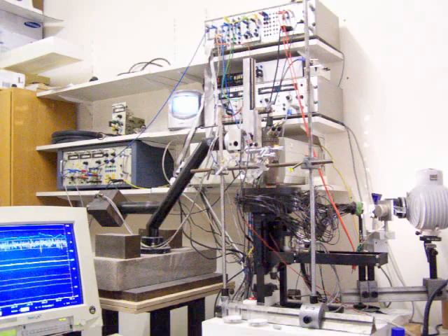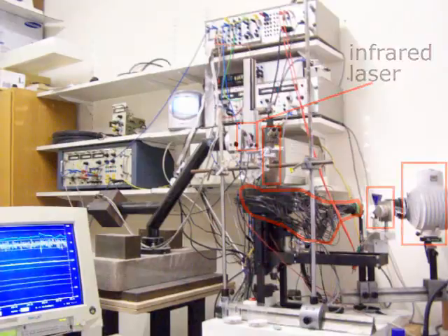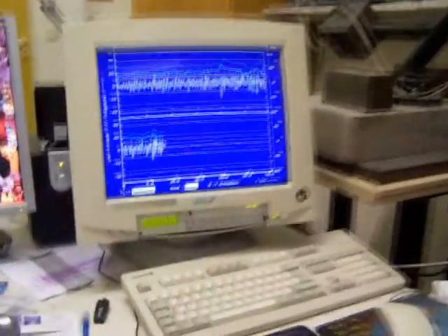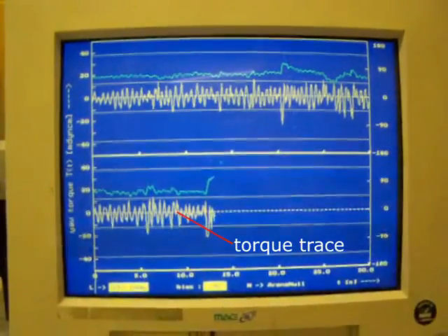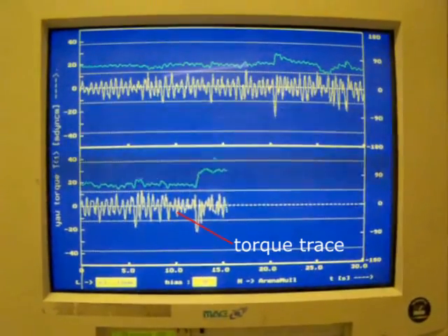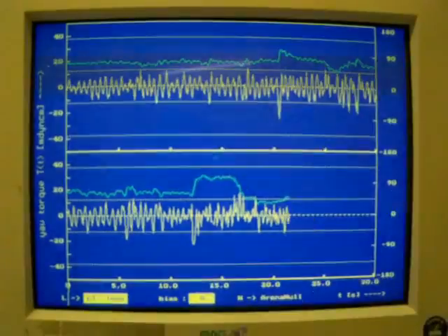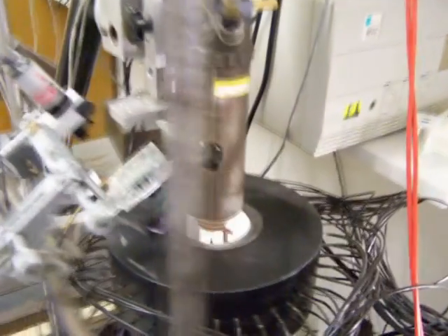And here is the real world setup with the torque meter in the center, the light source, the color filters, light guides, and the laser. On the computer screen you can see the yellow torque trace. The position of the patterns on the arena wall is indicated by the green trace. Moving closer towards the torque meter, we can observe how the fly controls the position of the patterns around it.